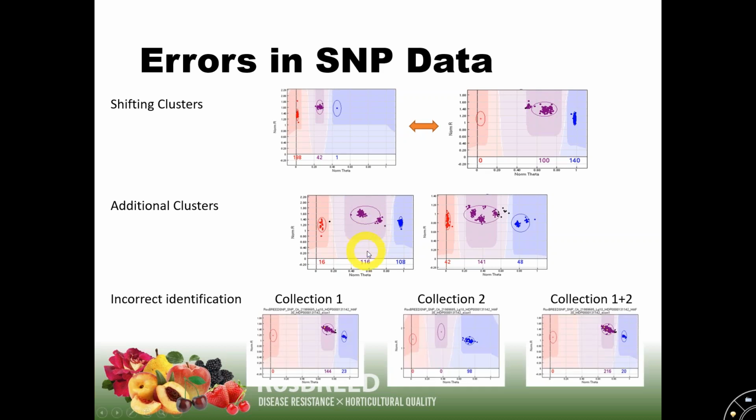And then the other point I wanted to point out is that in the first image, you see one germplasm collection of individuals that was genotyped, and we can see 2 clusters, an AB and a BB cluster. Now, in the second set of individuals that was genotyped and run separately in GenomeStudio, there was only 1 cluster, and it was called the BB cluster. GenomeStudio, in my experience, tends not to call the cluster heterozygous if there's only 1 cluster. So it will always try to make it a homozygous cluster.